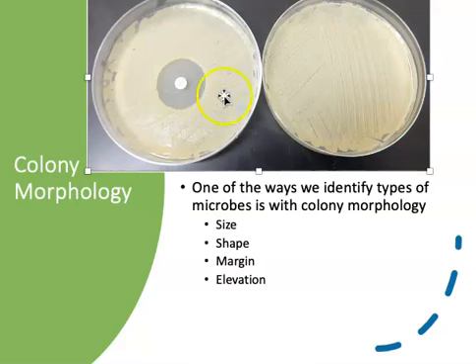But this plate is showing a test being conducted for some kind of antibiotic that is within this little white disc. What they've done is they've created the lawn by smearing, again, culture material all over the surface of this dish. Very concentrated culture material, lots and lots and lots of cells in there.